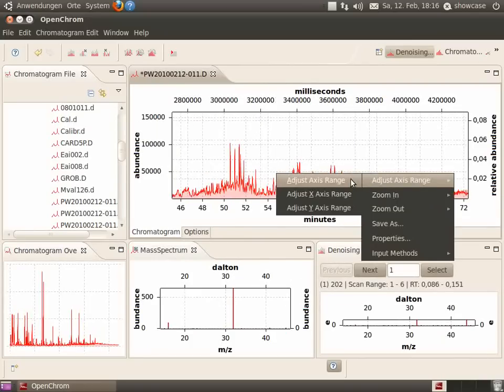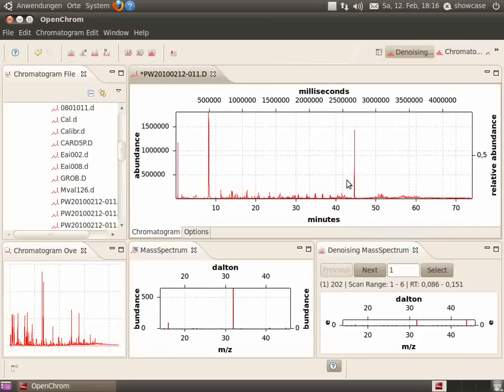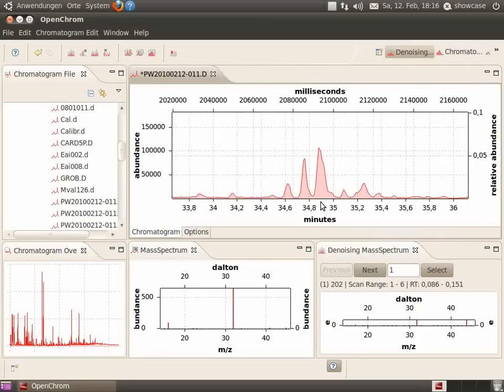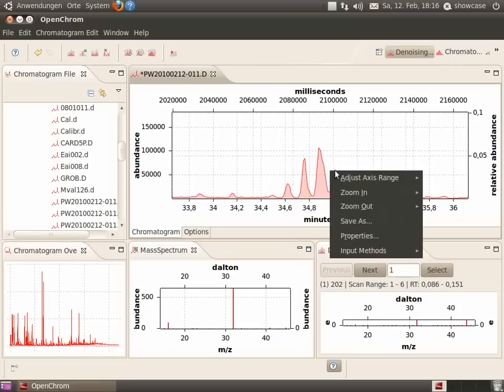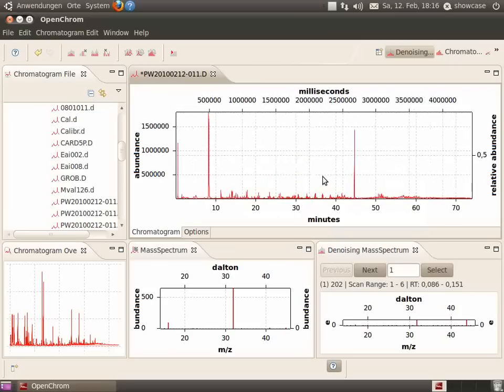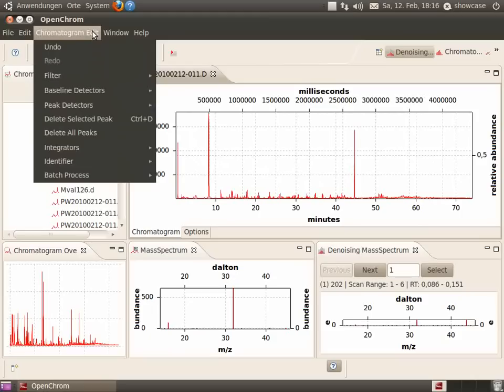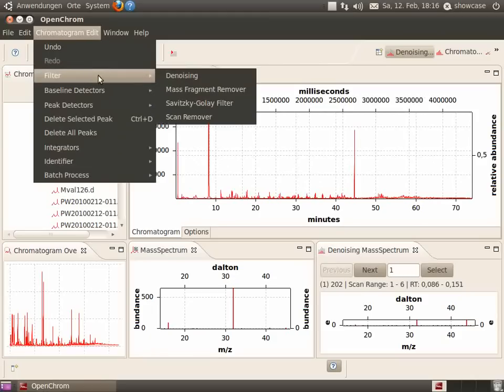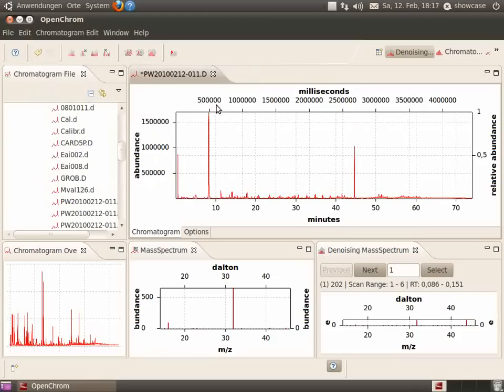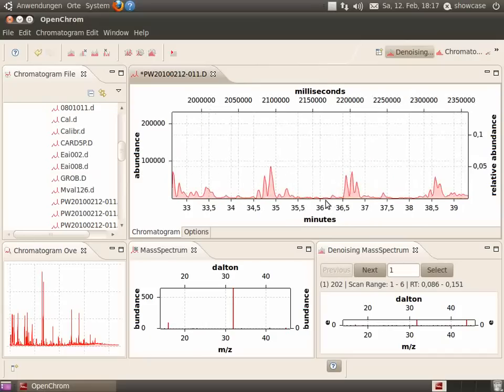Next, we would like to apply a smoothing filter on the data. You can see the peaks before and after the application of the Savitzky-Golay filter. The peaks have been smoothed.